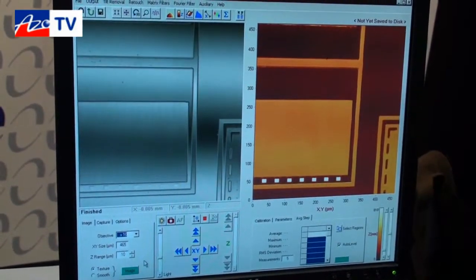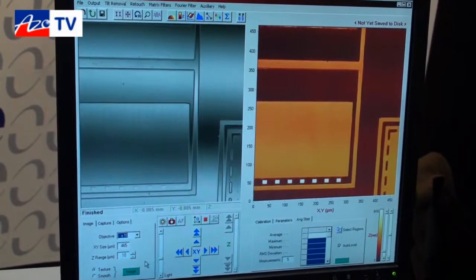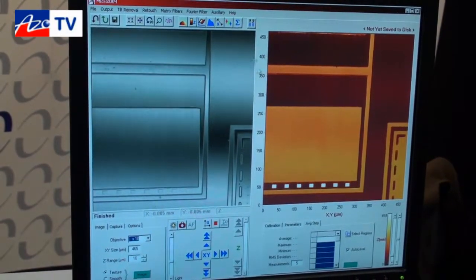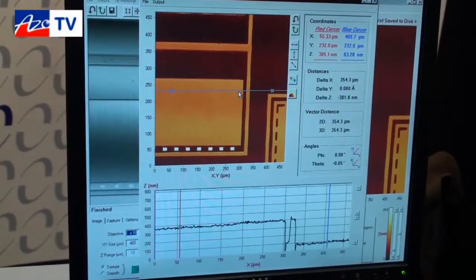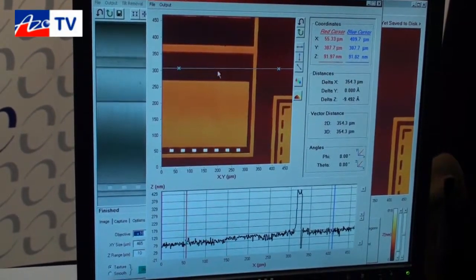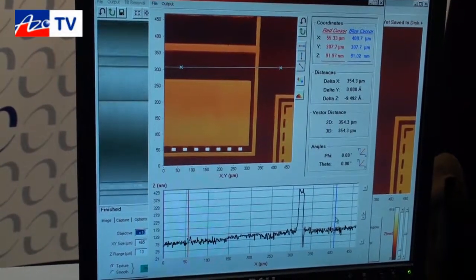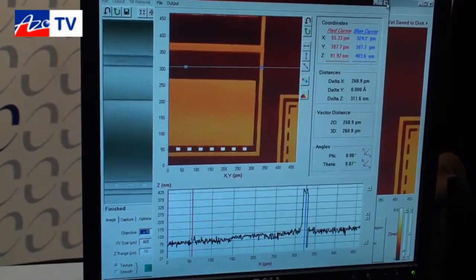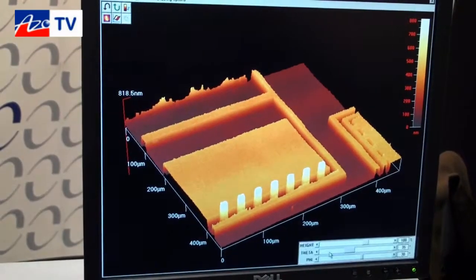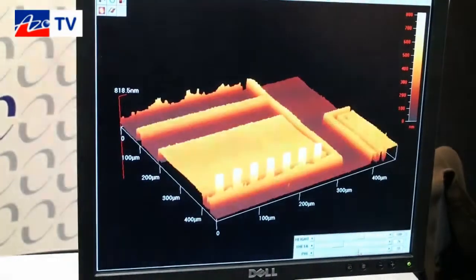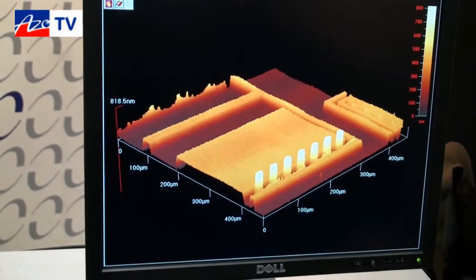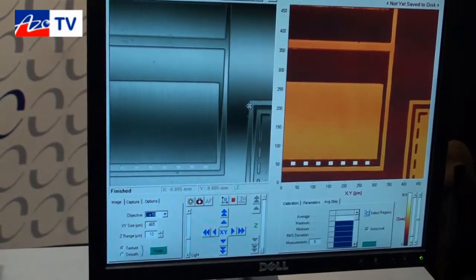We select our image and we get our data. It's a very quick data acquisition, and once we have this data we can get different types of output. We can get our Ra roughness values, step heights, and so on. We can also produce 3D data, and a number of other calculations can be done.